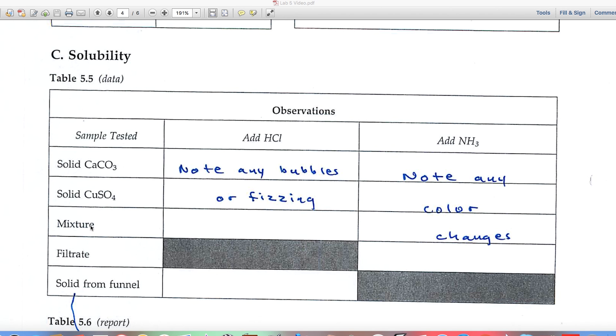And here's the mixture, and we're going to test now these substances. And we'll test the mixture, the filtrate, and the insoluble solid from the funnel.